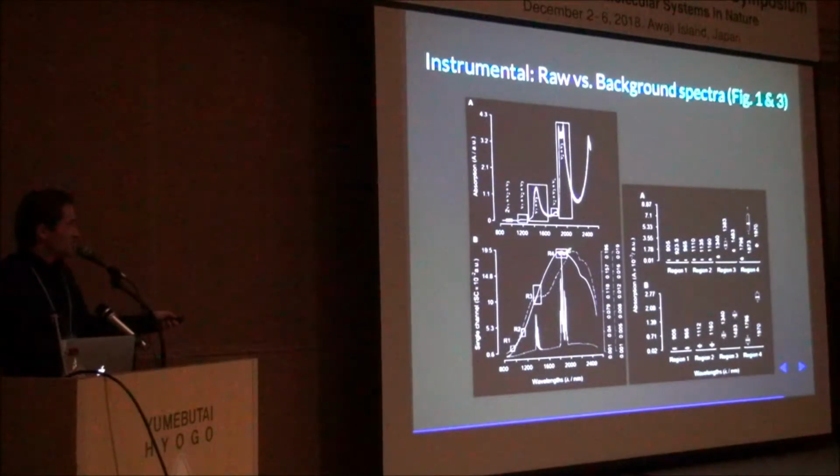And these are the 4 regions, labeled 1, 2, 3, 4. These are the typical regions. These are the water vapor bands in R4 and R3. And so that's the background spectrum. This line here shows the standard deviation of those spectra.